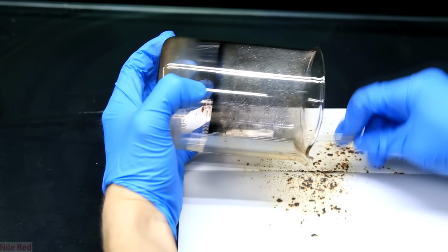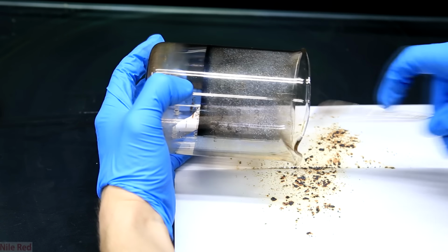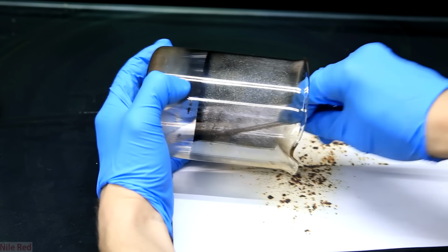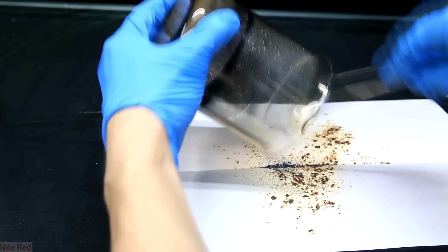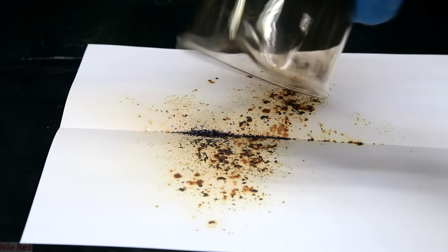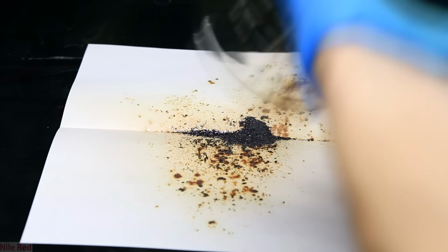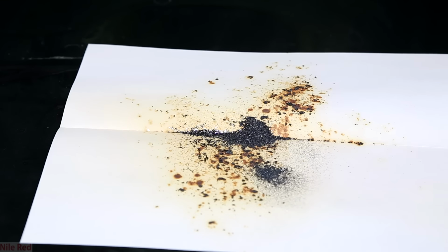We're only interested in what's collected on the side of the beaker, and we don't touch anything that's at the bottom. The iodine on the side of the beaker should be nearly pure, whereas the stuff that remains at the bottom is going to be pretty dirty. So everything I've scraped off the walls, I dump onto the piece of paper. Here you can see we're starting to get a little bit of a pile going.